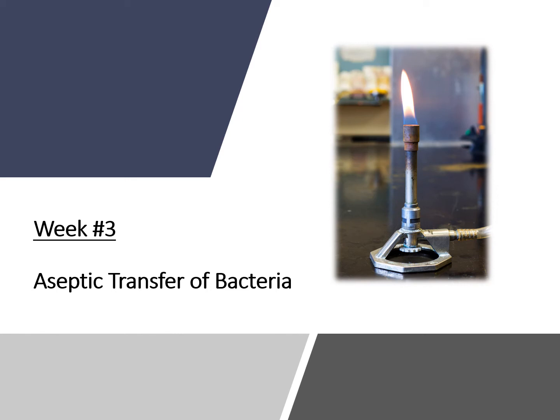Hello students, this week we're going to talk about how we can transfer bacteria from one media to another using aseptic techniques.